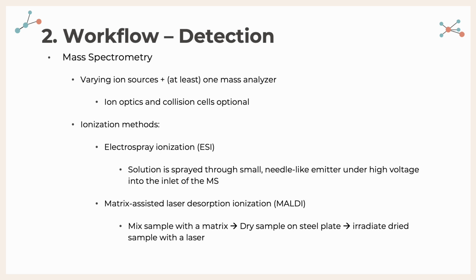One thing to note, I did mention that these two are very commonly used in proteomics. This is because these are soft ionization methods, and so this prevents severe fragmentation and severe breaking of the molecules in the sample.